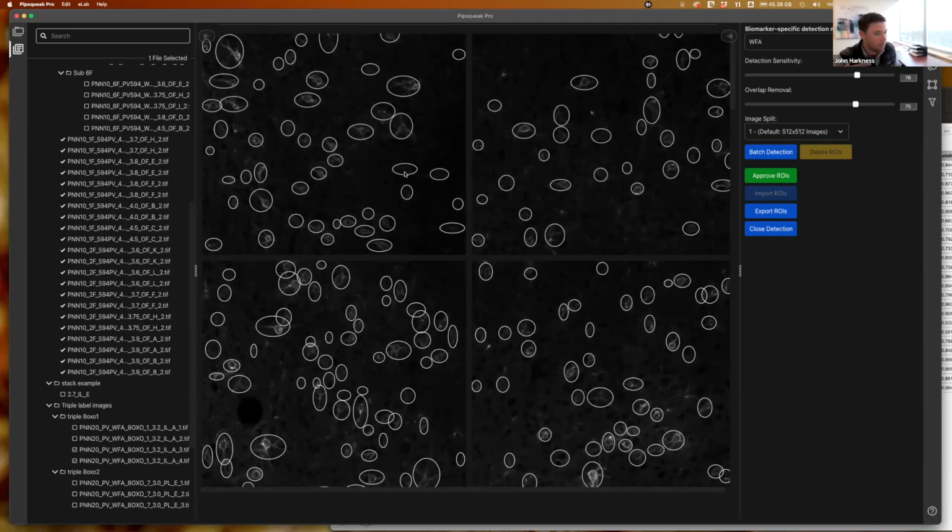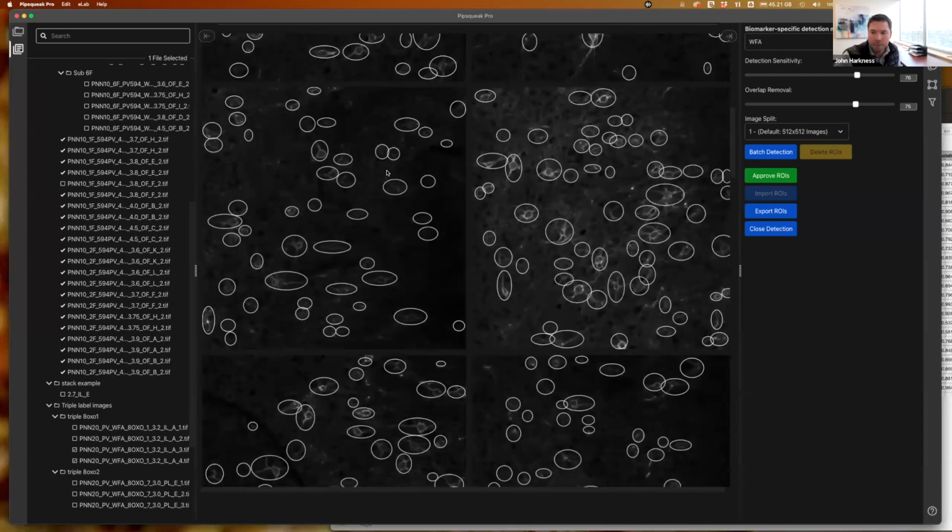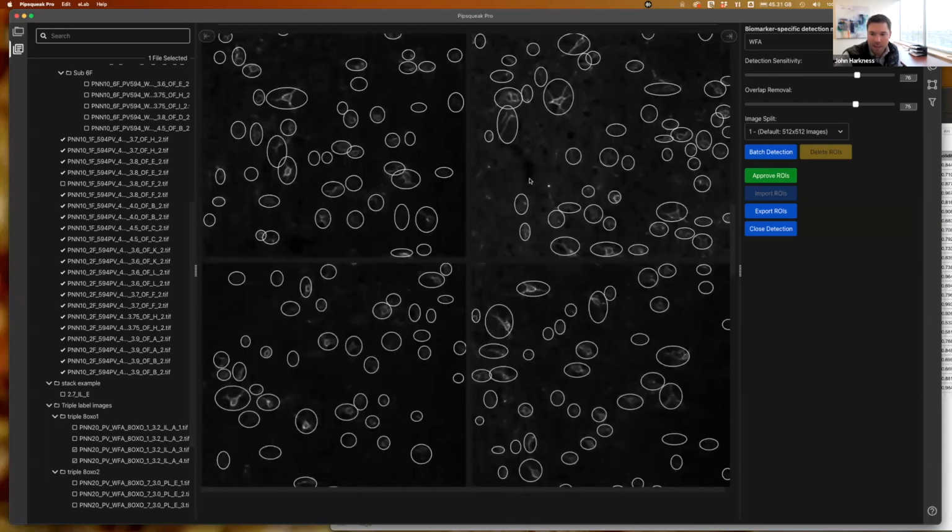This also still allows me to go in and make that certification of the detections that it's captured, because, as a scientist, I'm not going to take its detections blindly. I want to make sure that I agree with what it's detected here. And so for me to be able to do that, I can click into any one of these images. I can, again, draw on it, draw the cells that I would want or change the cells. I could go back and I can reanalyze this image in particular if I wanted to do that. And I can basically do that for everything that I've batch processed.